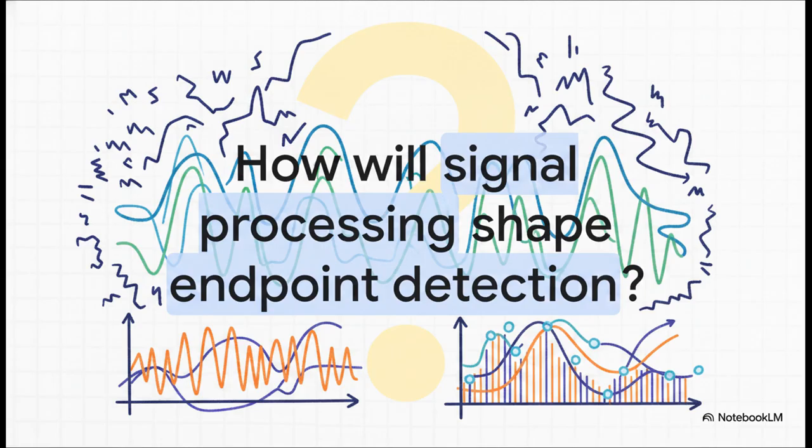And that leaves us with a pretty fascinating question to ponder. As automated titrators continue to evolve, how will advanced techniques like digital signal filtering, Savitzky-Golay curve smoothing, and Fourier transforms further shape the future of analytical chemistry? It's a really exciting frontier, and it proves that even the oldest analytical techniques are still ripe for digital innovation.